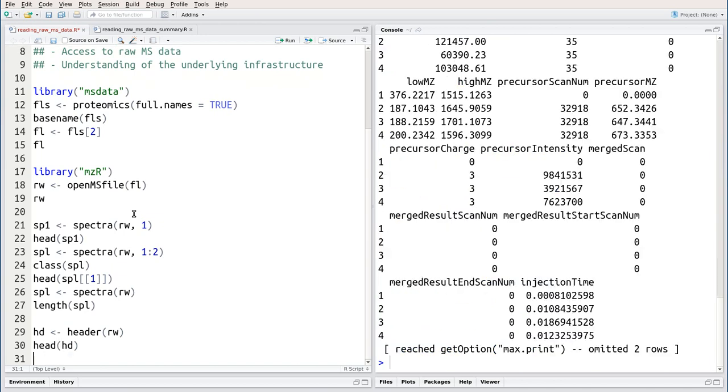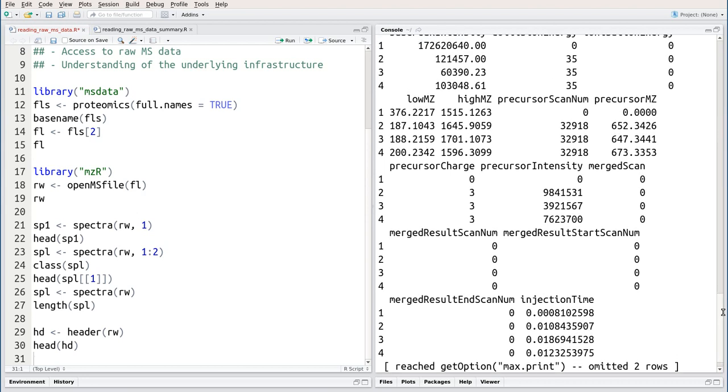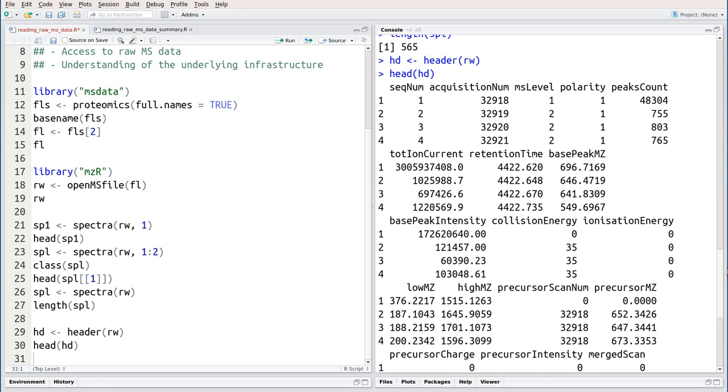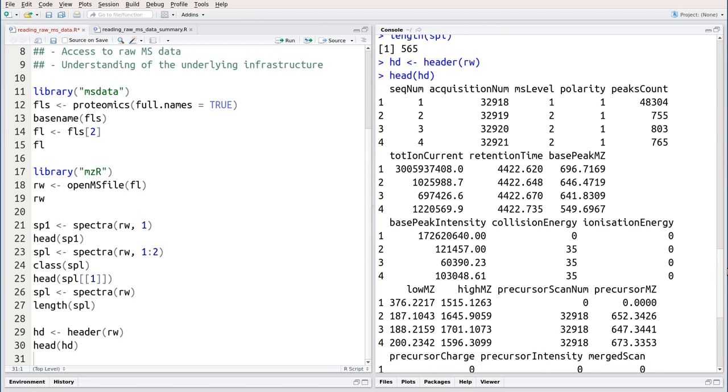This variable hd is a data frame that contains 565 rows, one for each spectrum. And for each spectrum, we have a set of annotations, 22 in this case.